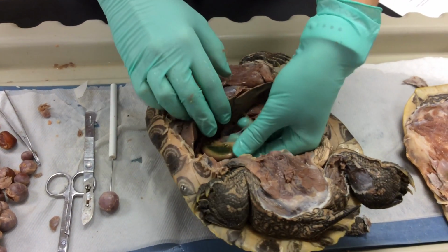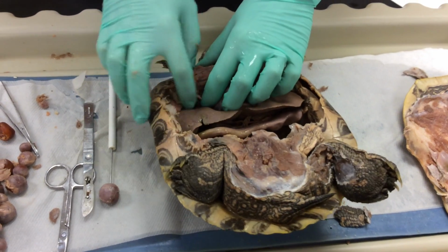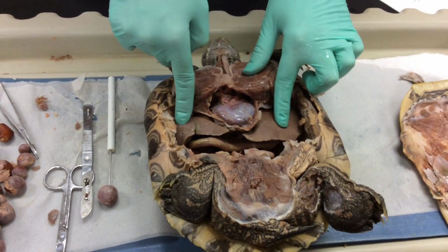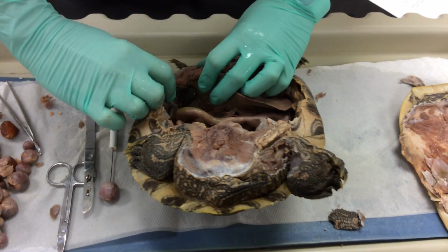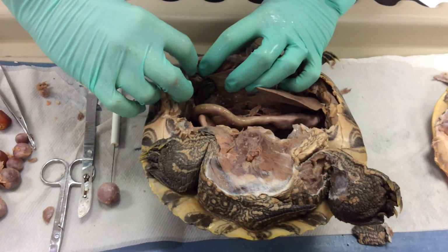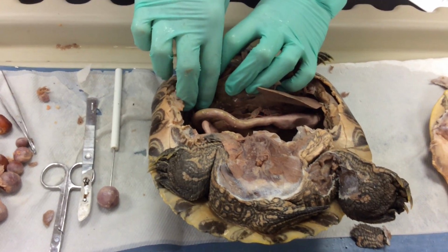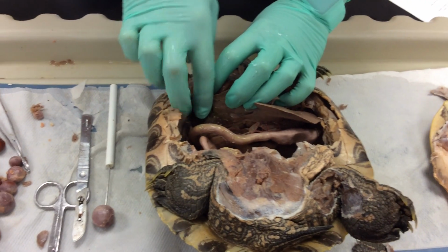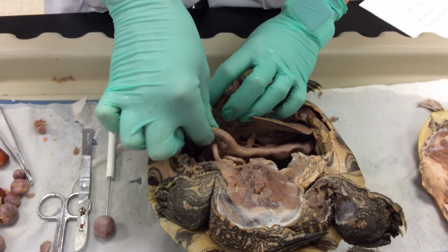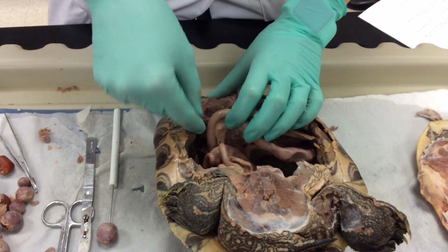Now you see the green region, and that actually comes from, here's more liver, so this large structure here is the liver, and the green comes from the gallbladder. The gallbladder is this sac in here, and you can see this dark green structure, that's the sac. The gallbladder is going to store the bile that's produced by the liver, and then it's going to be inserted into the small intestines to allow for it to break down other particles of food.